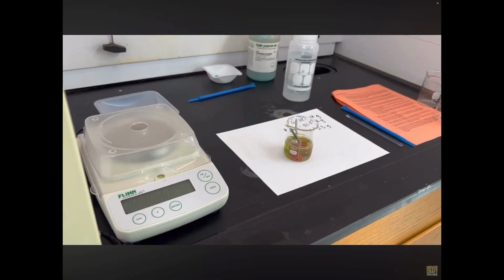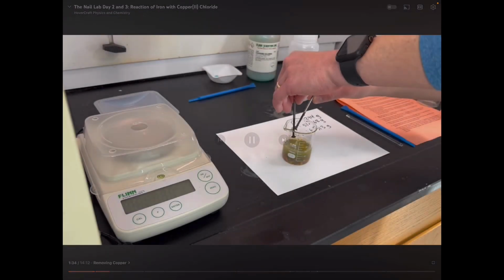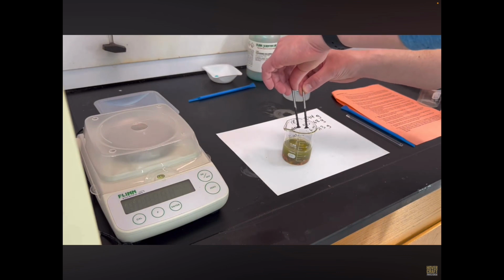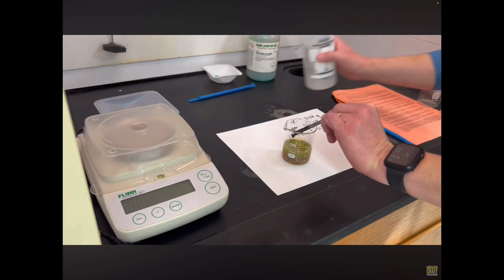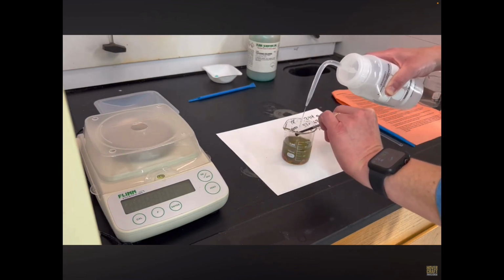That is copper that has formed on the surface of the nails. Today's procedure is all about collecting that copper off down into the beaker. You'll also notice that the surface of the nails looks different, and it actually is thinner because, again, while the copper forms, you also have metallic iron turning to ionic plus 2 iron ions, and they get dissolved in the solution. So I'm going to try to rinse any of that copper down into the beaker that may have been clinging to the nails.